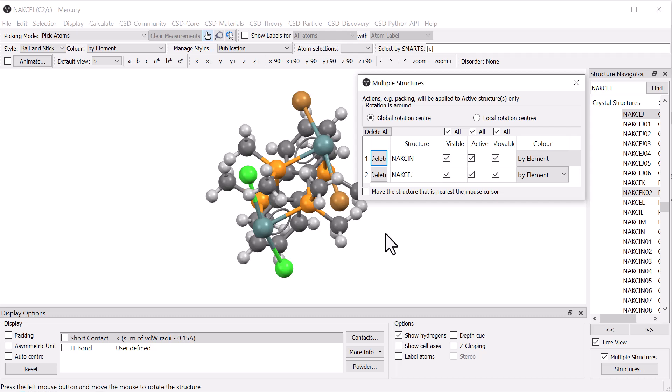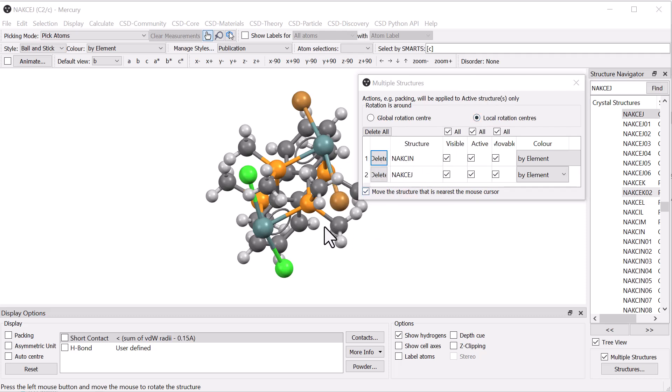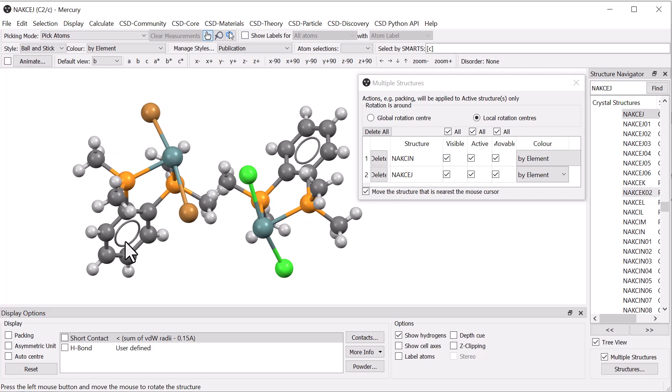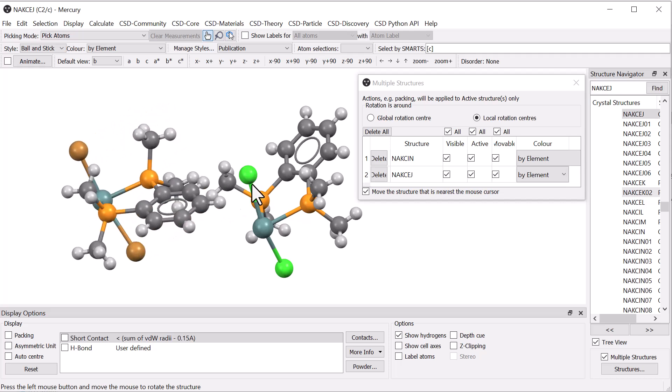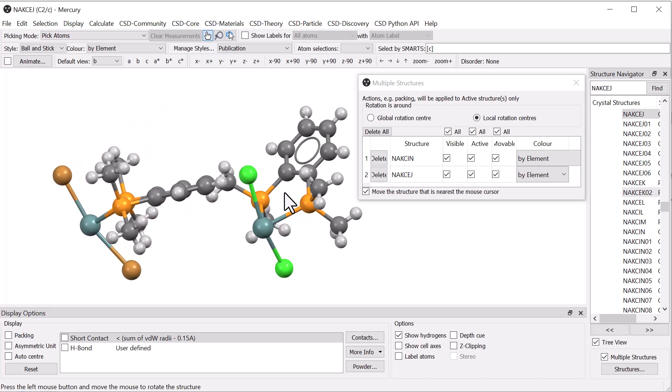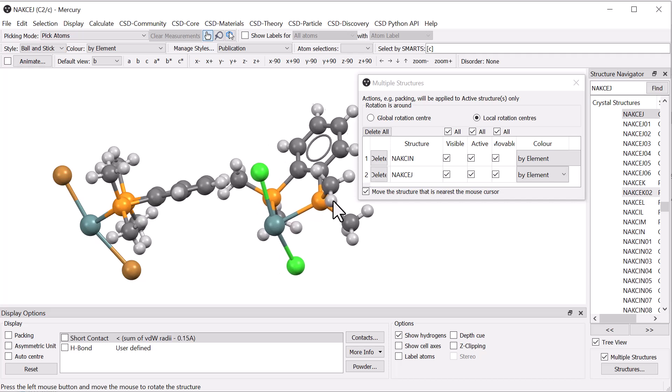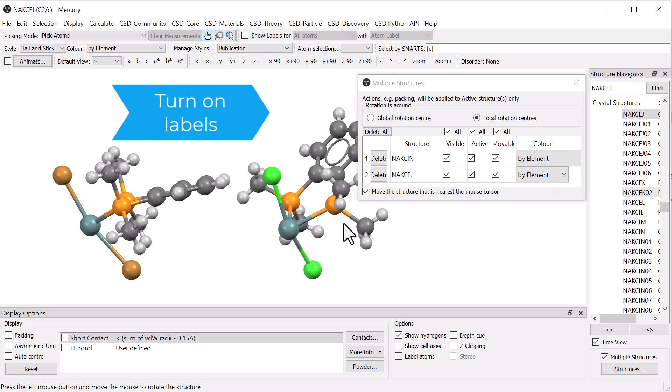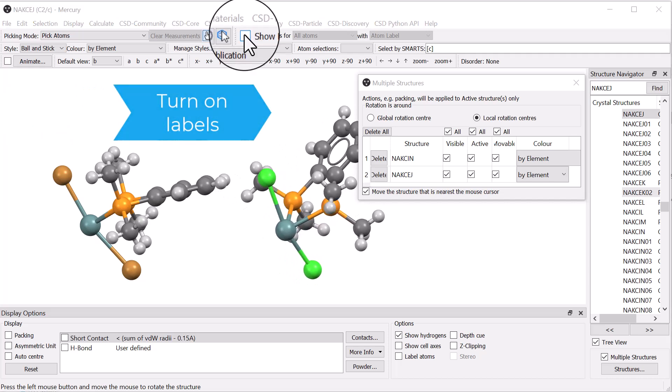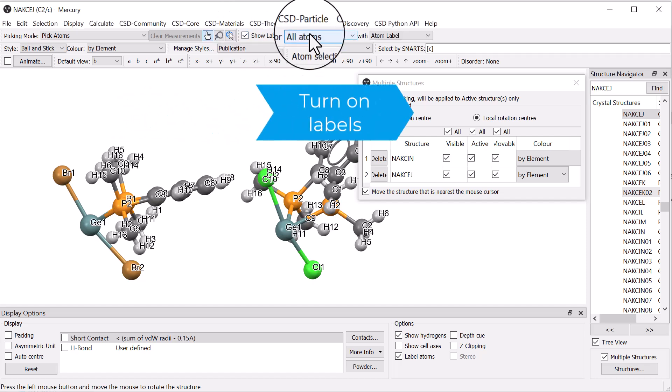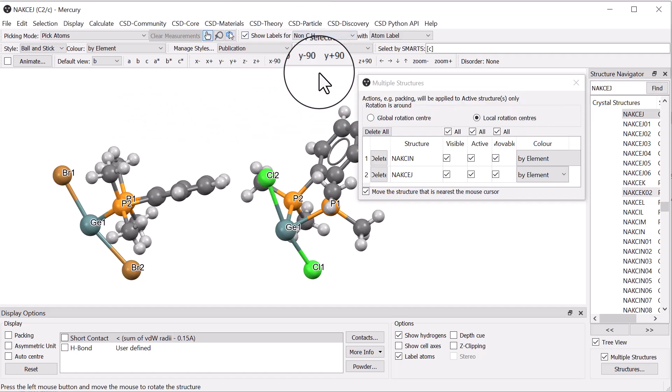To make it easier to compare the structures, select local rotation centres and move the structure that is nearest the mouse cursor. You can now reposition these to make them easier to compare. From the top toolbar, tick Show Labels and from the drop-down options select Non-CH. You can see a common labelling scheme is used for these structures.